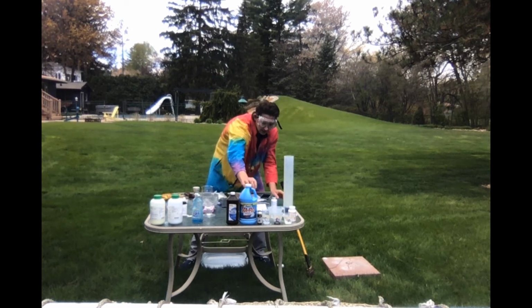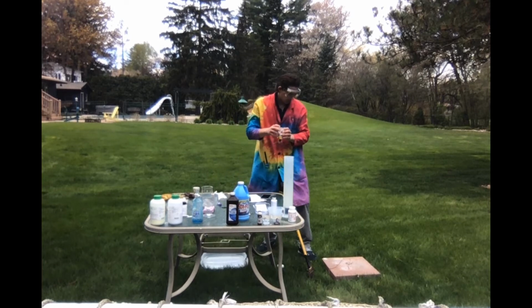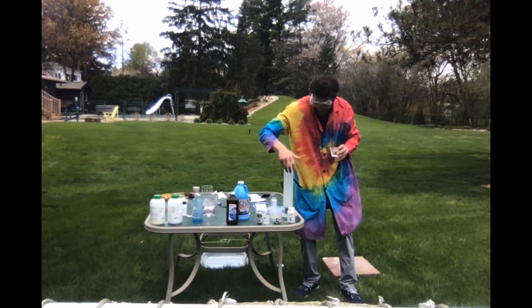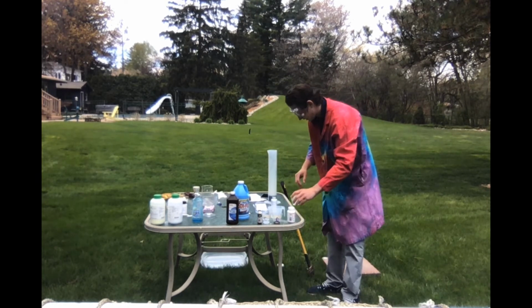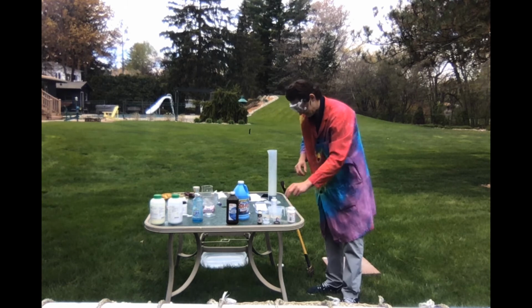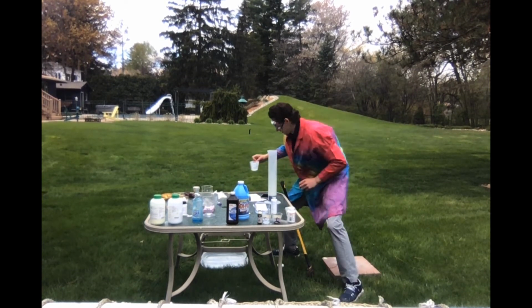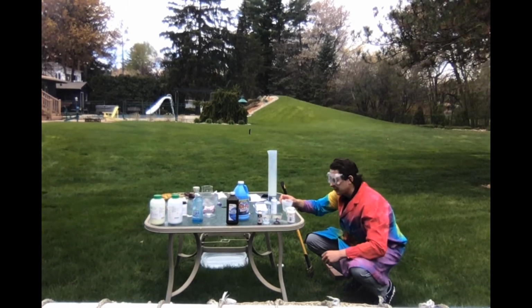What the iodine clock is, in cup A, we have ground up pieces of vitamin C. Okay, ground up pieces of vitamin C, and it's just a fine powdery substance. And I'm going to add 60 milliliters of water. I got my water back here. Got to get good, accurate measurements.